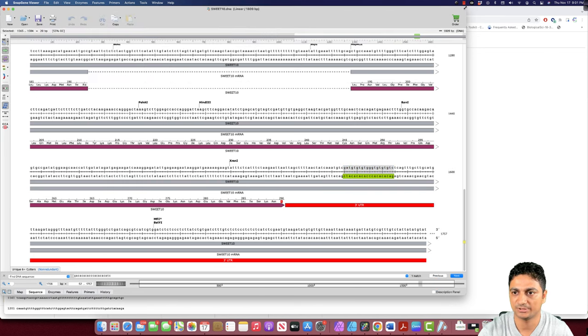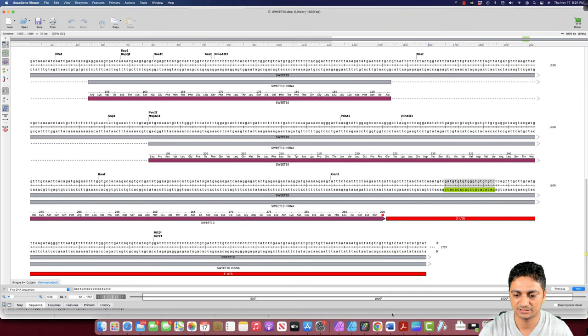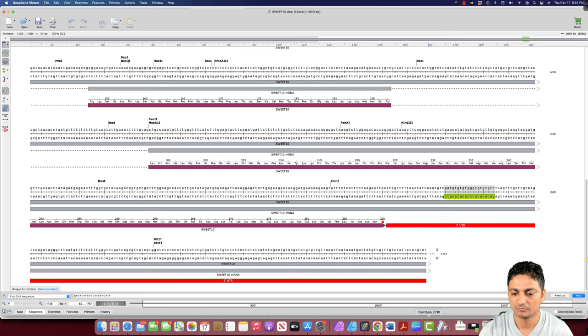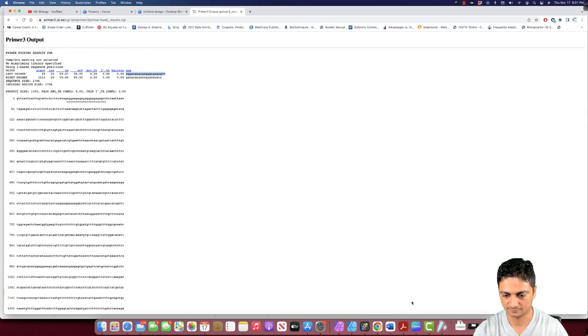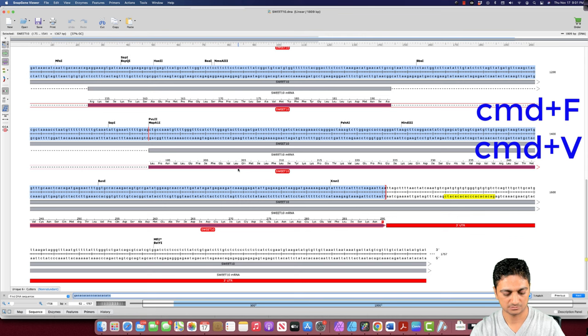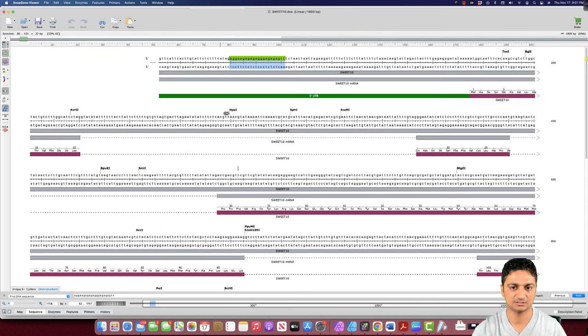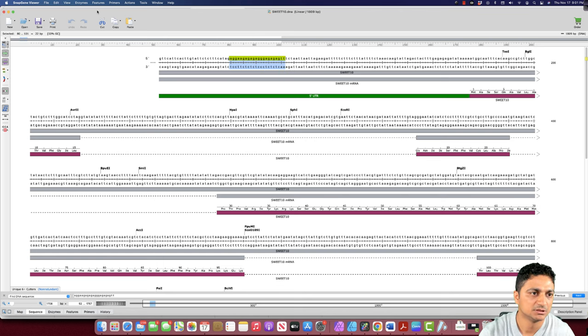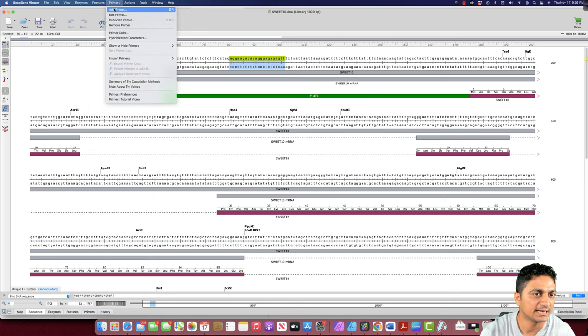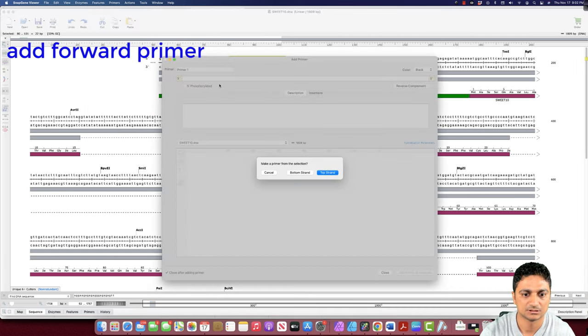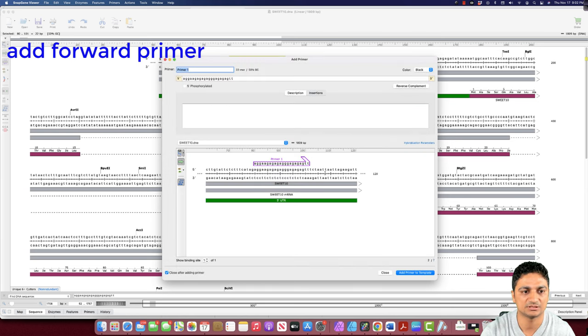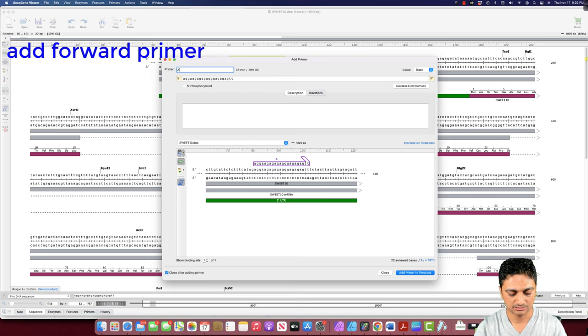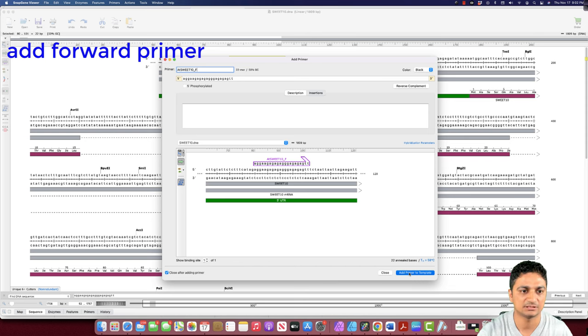Now let's copy the primer sequence and add a primer feature here. I'm going to copy the forward primer sequence. Control F, Control V. We are finding and pasting the primer. This is the primer sequence, the forward primer sequence. I'll go to feature or primer, add primer. It is the forward primer on the top strand. I can give the name of the primer. It is Arabidopsis Thaliana switch 10 F. This is the forward primer. Add primer to the template.